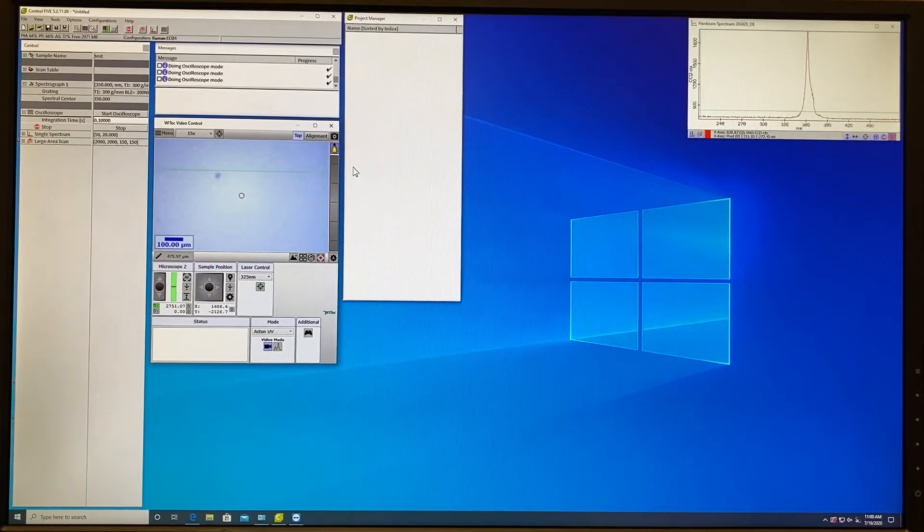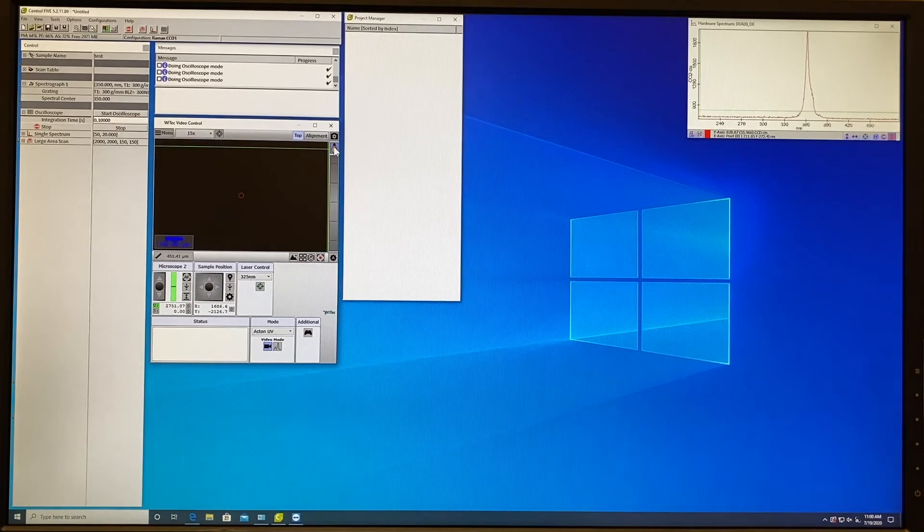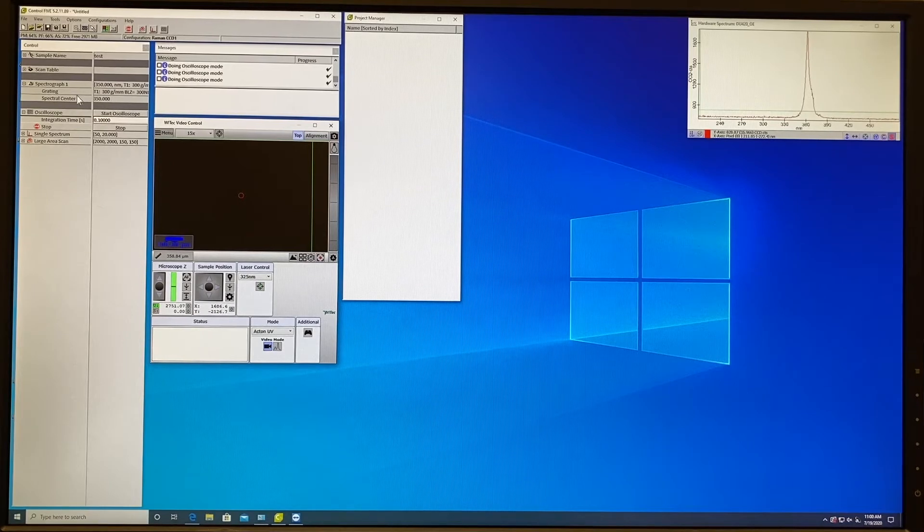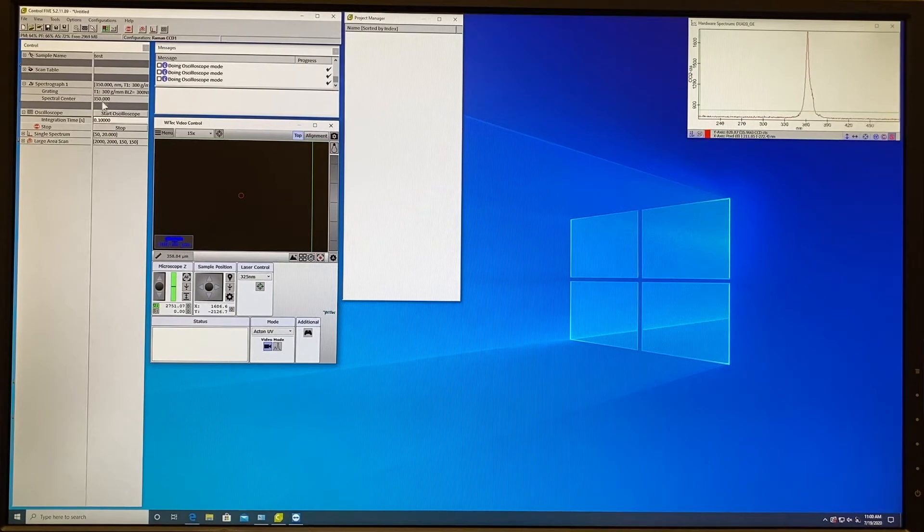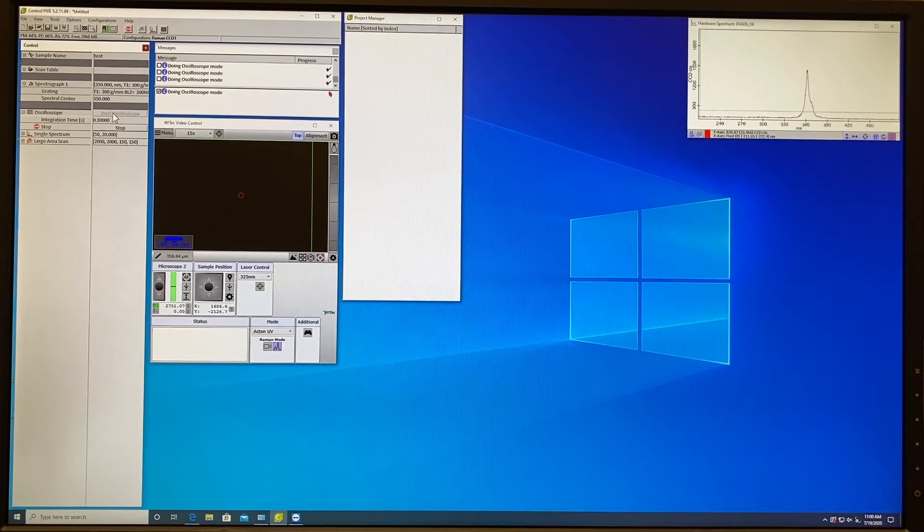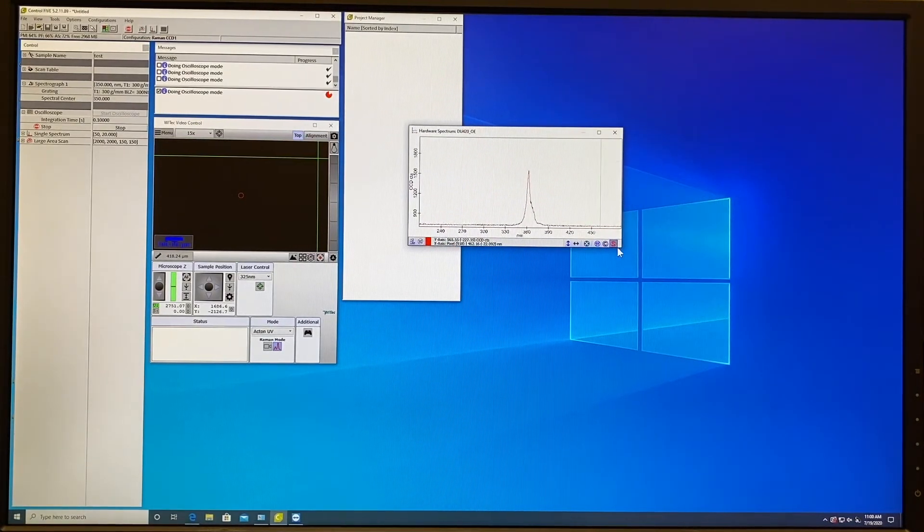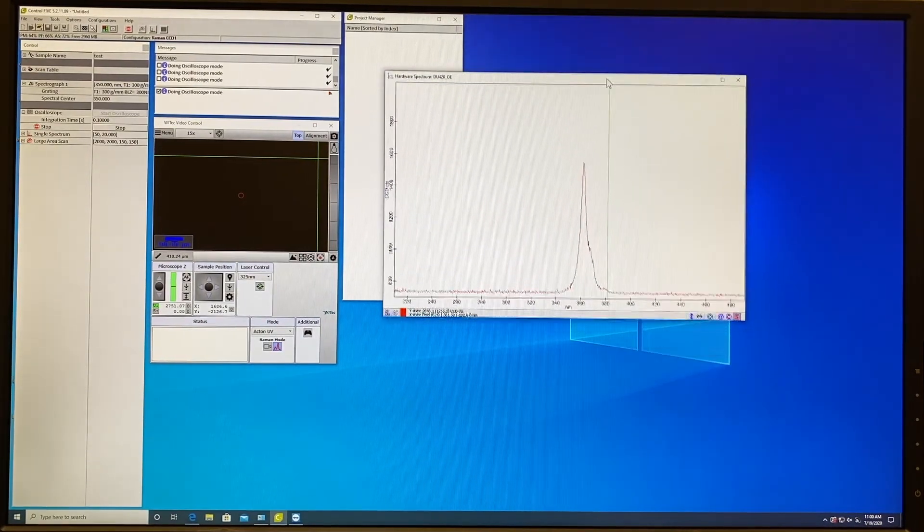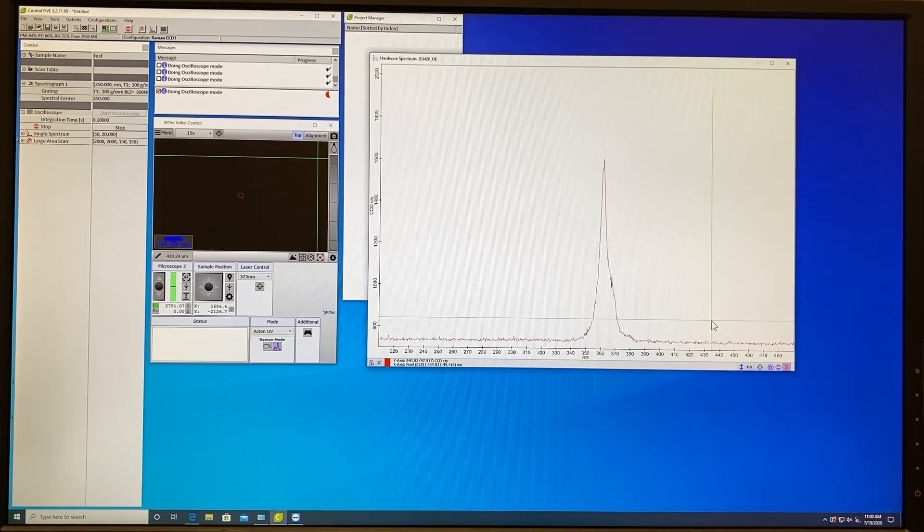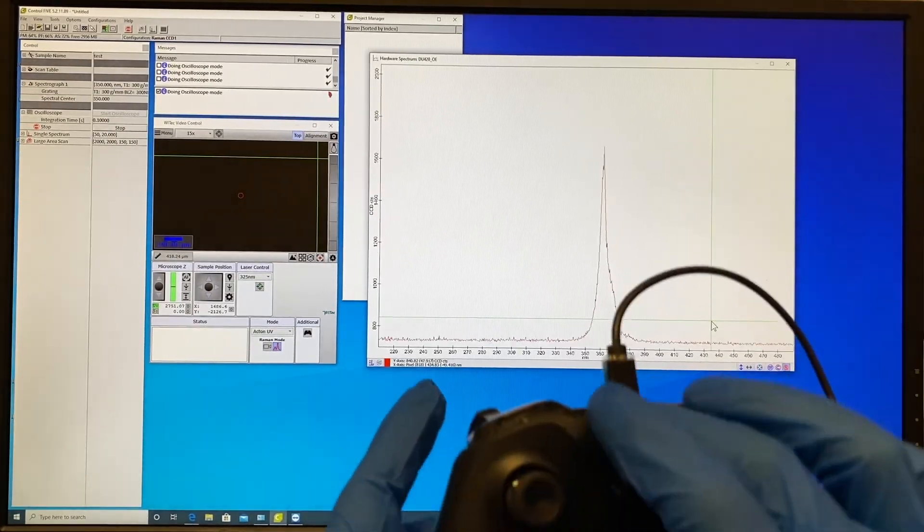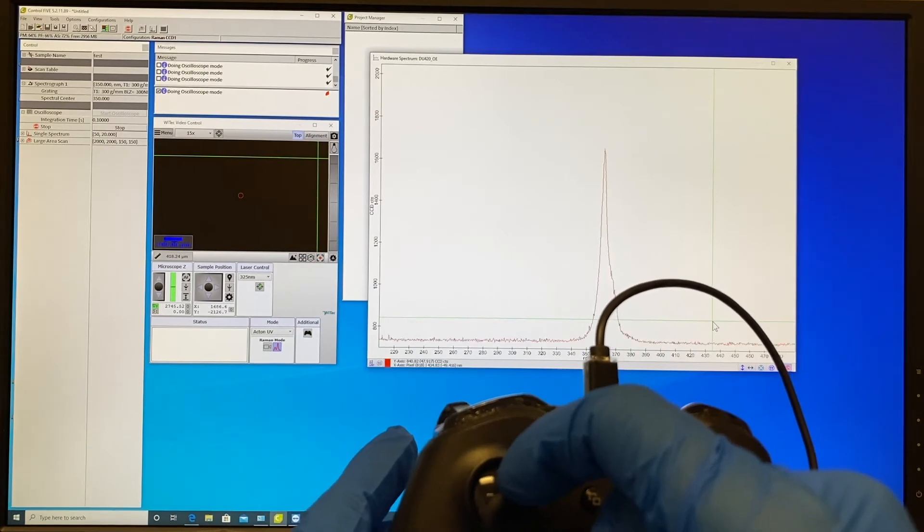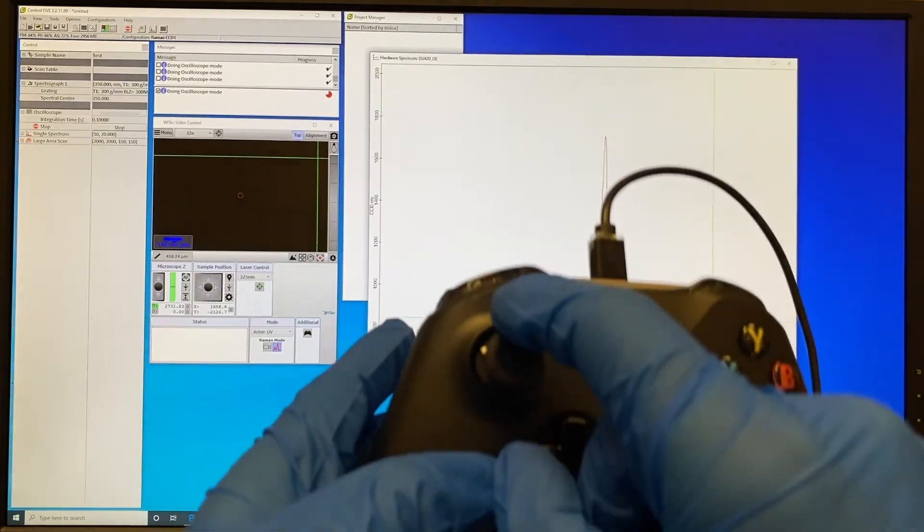Once the shutter for UV laser is open you have to stop the illumination. Go to spectrograph to check again the spectral center you want to observe and that the units are in nanometers. Then you go to oscilloscope and start oscilloscope. This will open new window on the side which will show the PL spectrum of your material. For example this is gallium nitride emission. To adjust better response from the photoluminescence you have to use the Z knob and go up or down to focus on the material. You will see that the intensity will grow.